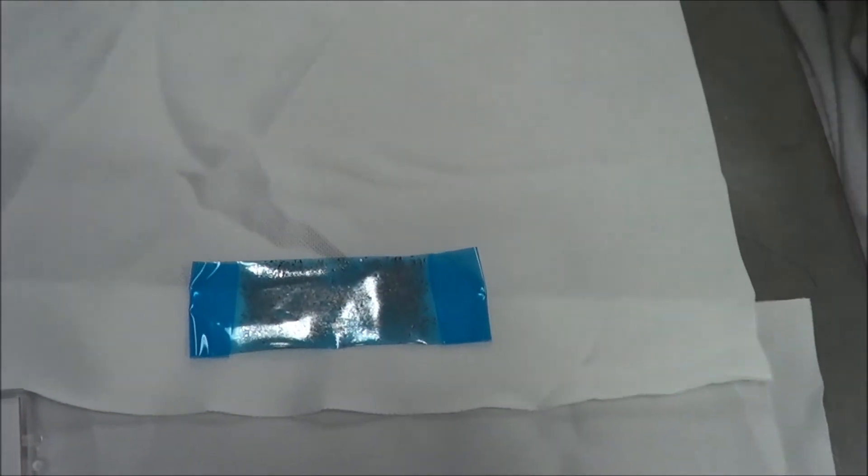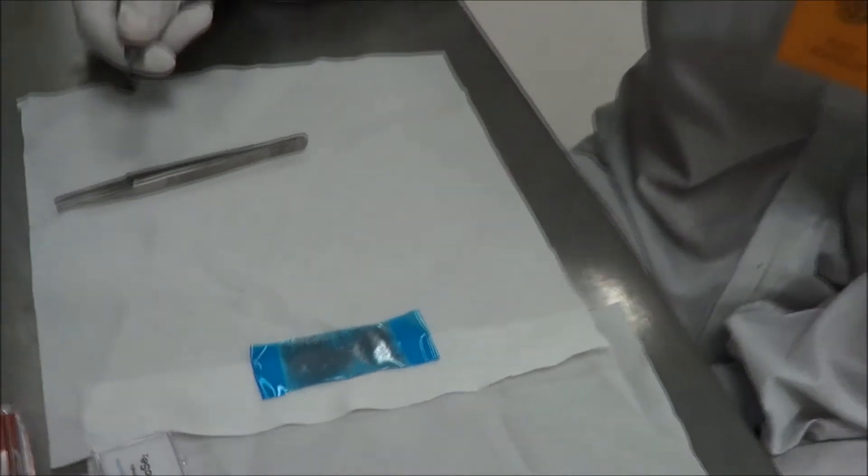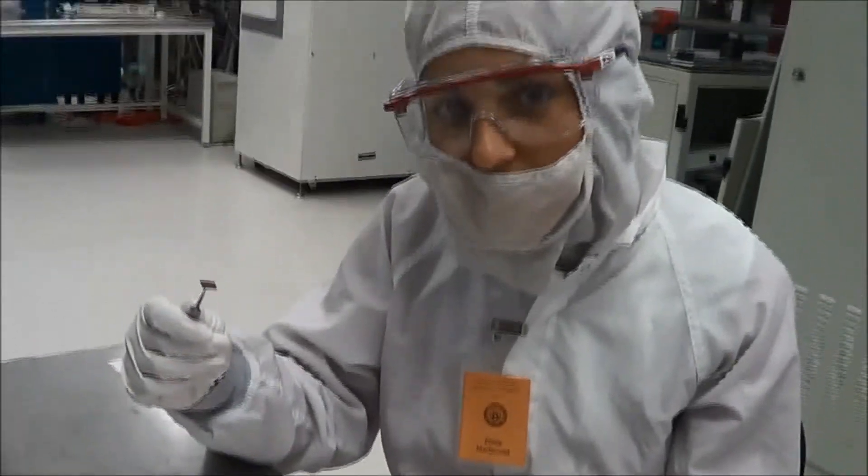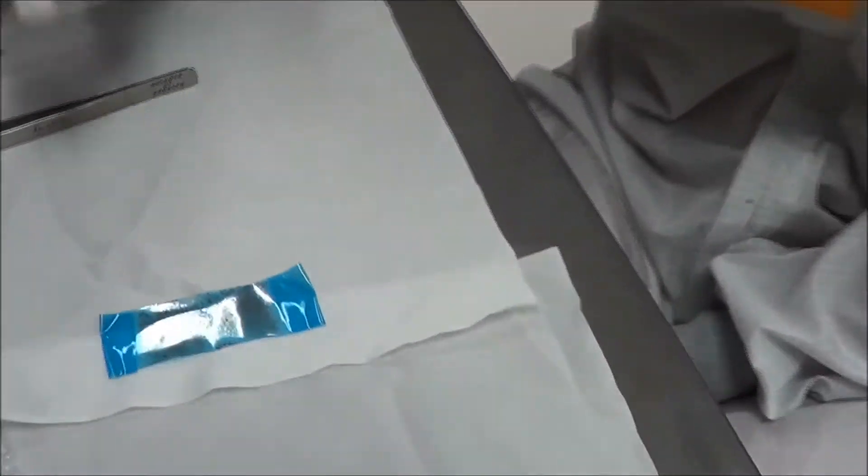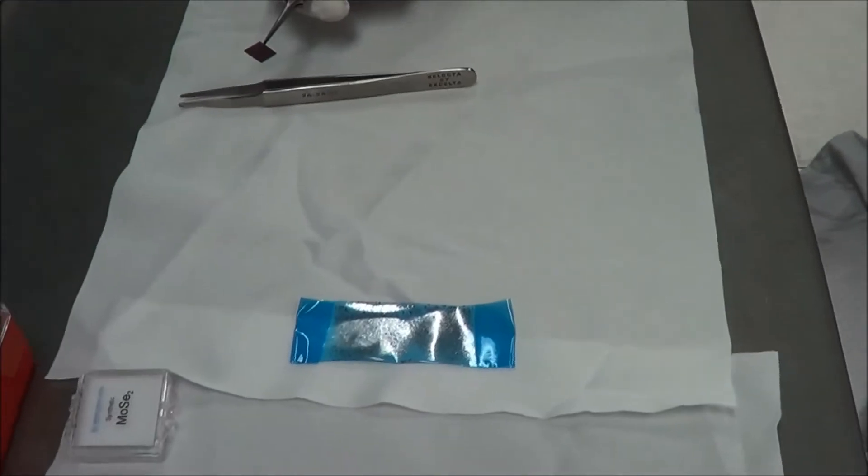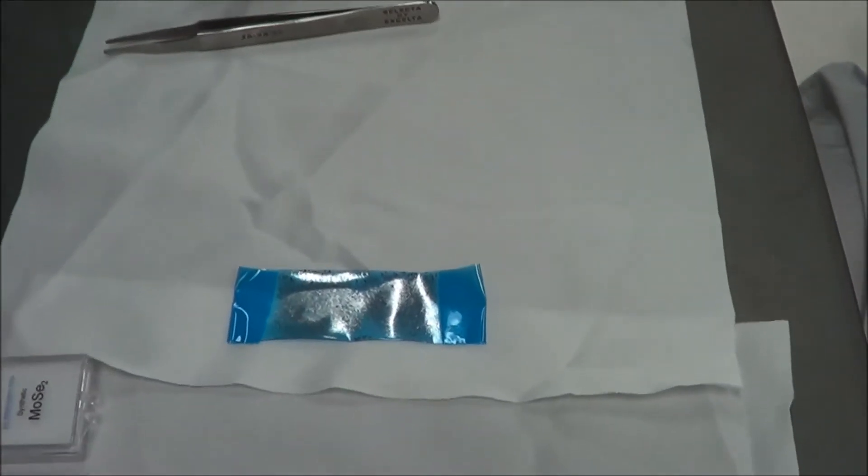In order to transfer the flakes onto your silicon-silicon oxide wafer, simply take the silicon-silicon oxide wafer, place it on top of the blue tape and tap each of the four corners. Then remove the silicon-silicon oxide wafer.